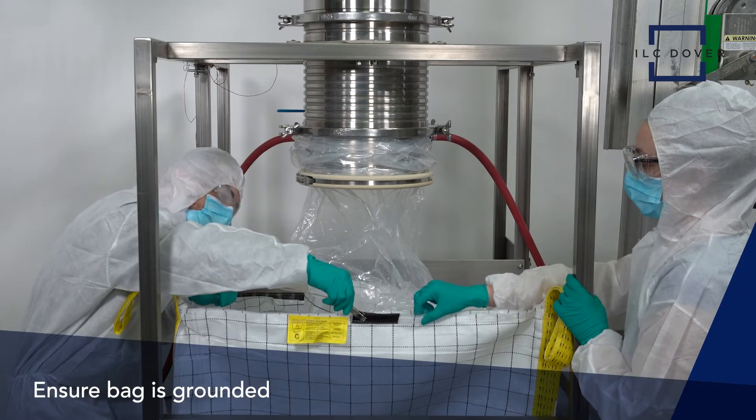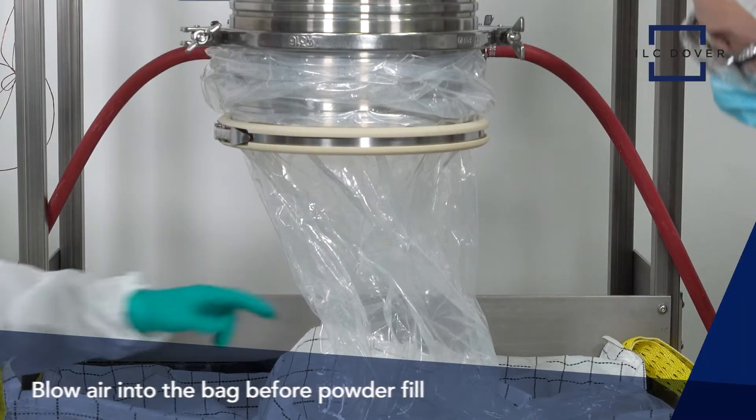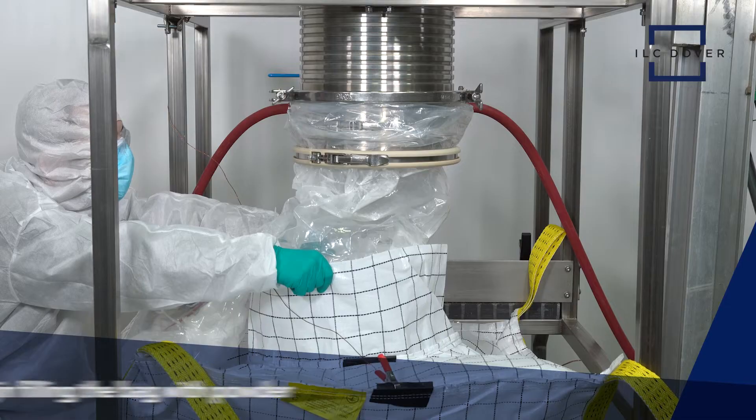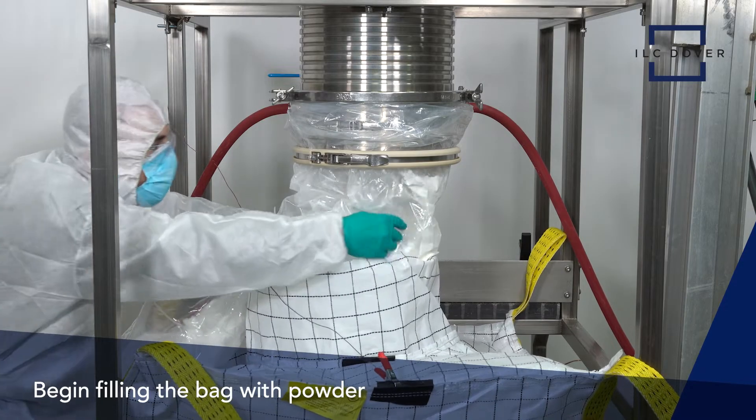Ensure the bag is grounded and then blow air into the bag before letting the powder fill occur. Now, just begin filling the bag with powder.